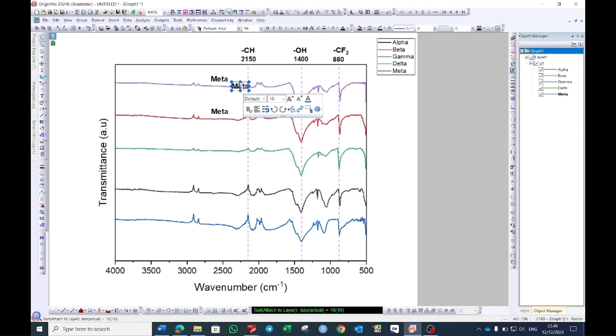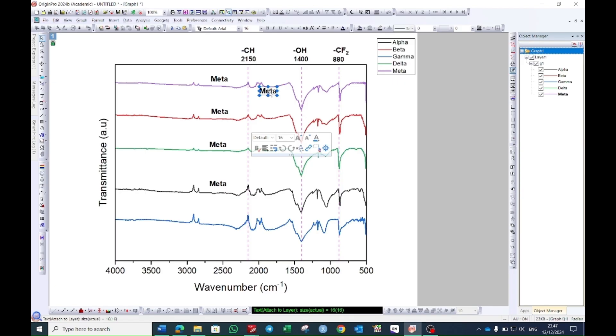This way you can place as many lines as you want in your graph. Then you double click on this one and then you can change the name.